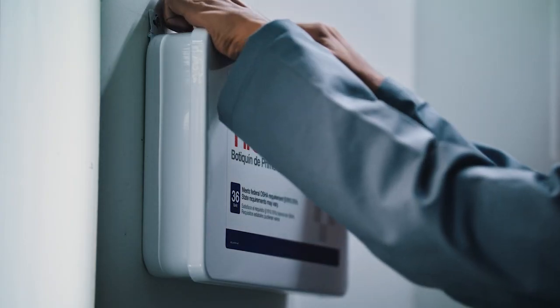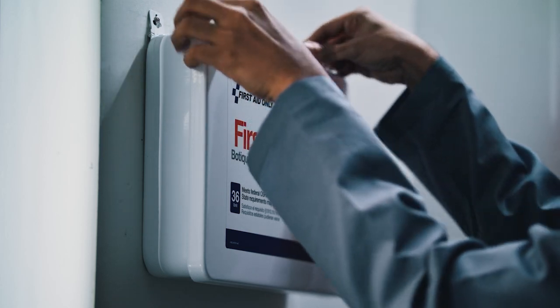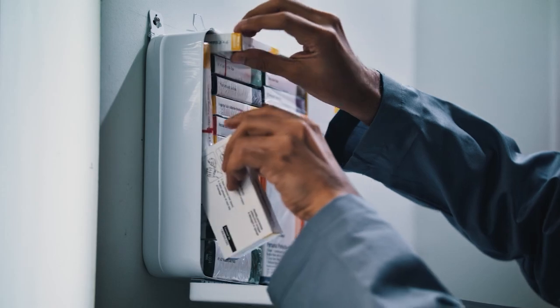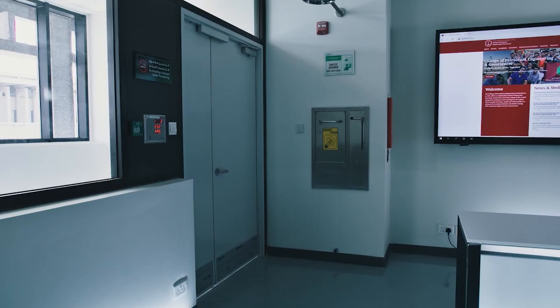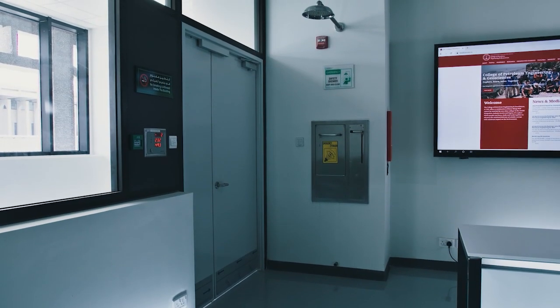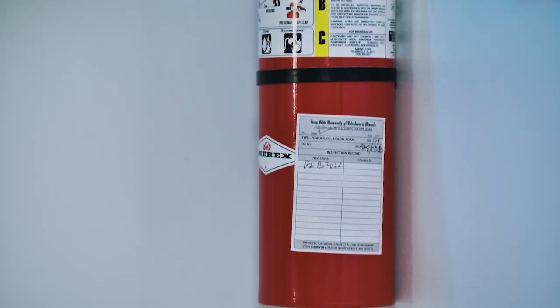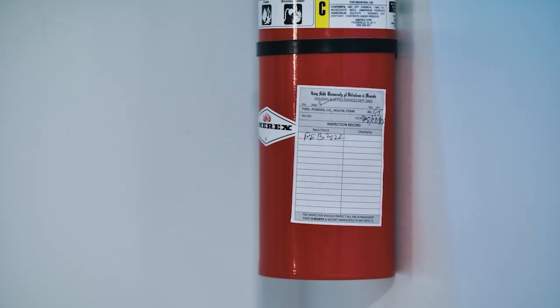Practice walking to them. If your laboratory is equipped with more than one of these items, note the location of those closest to you. Some of this safety equipment, such as fire extinguishers, is tested periodically and will have a tag including the date that testing is due.